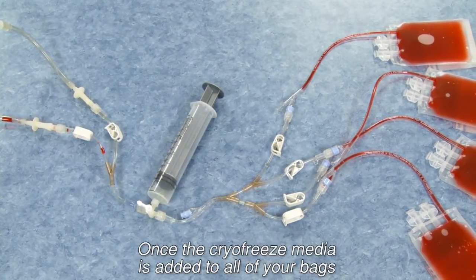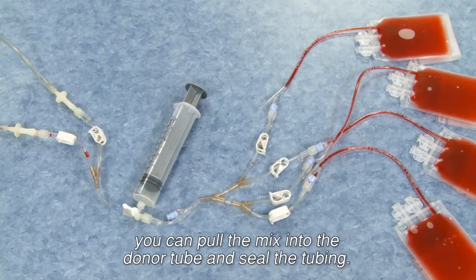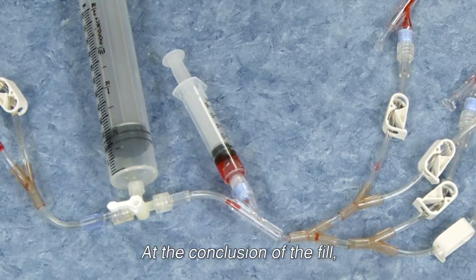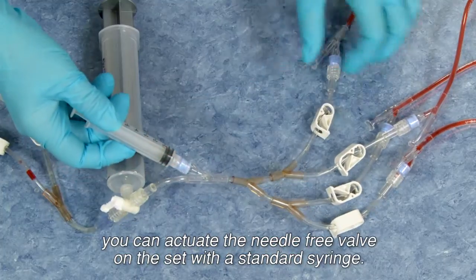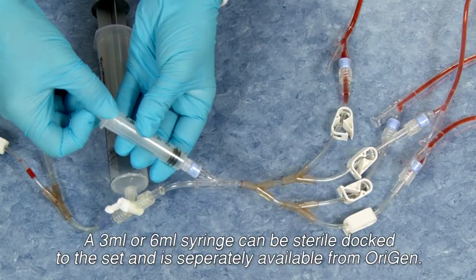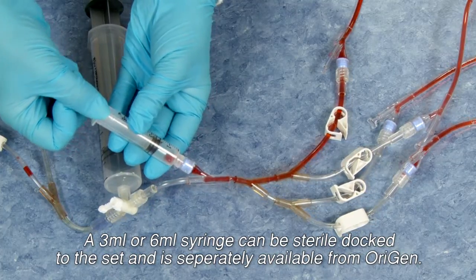Once the CryoFreeze media is added to all of your bags, you can pull the mix into the donor tube and seal the tubing. At the conclusion of the fill, if you need to take samples for final HLA typing or bacterial sampling, you can actuate the needle-free valve on the set with a standard syringe. A 3ml or 6ml syringe can be sterile docked to the set and is separately available from OriGen.